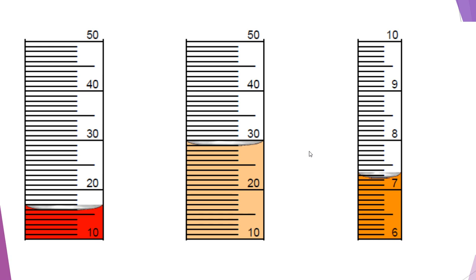So we are 7.2 milliliters in this graduated cylinder. Again, the hash marks in this graduated cylinder do not represent whole milliliters. They do not represent whole numbers. These represent decimals.